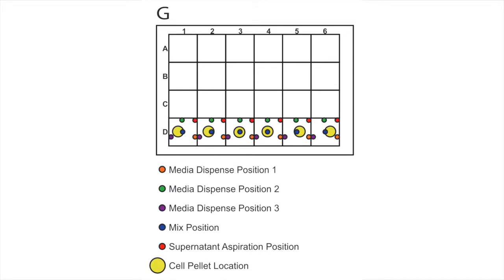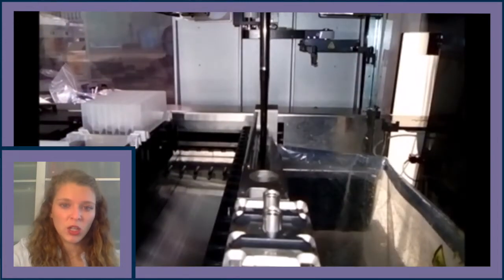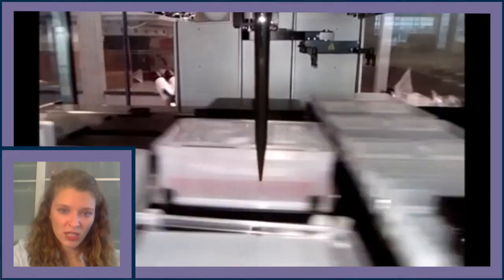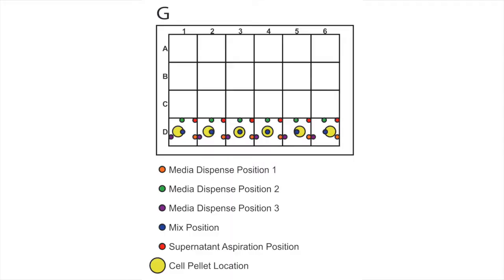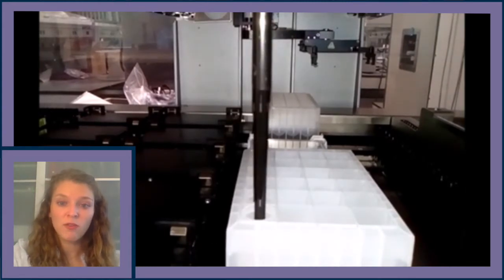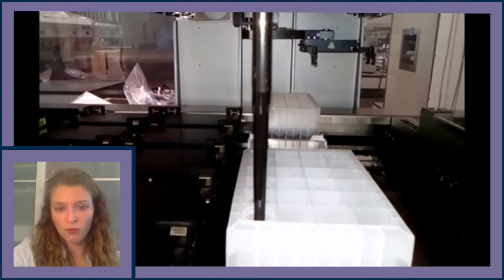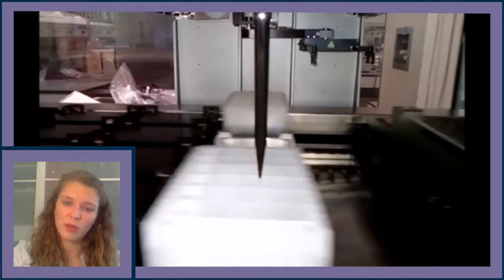The 24-well microplate is re-lidded and moved to the centrifuge loader. After centrifugation, the supernatant must be aspirated from distinct locations to ensure the cell pellet is not disturbed. New tips then aspirate mTeSR1 plus rock inhibitor, and 2.2 milliliters are added per well of row D to resuspend the pellets. The method collects 200 microliters of cell suspension from each well and dispenses it into a Vi-Cell counting tube inserted into another 24-well microplate. The operator can then take these tubes for manual counting outside the robotic platform.